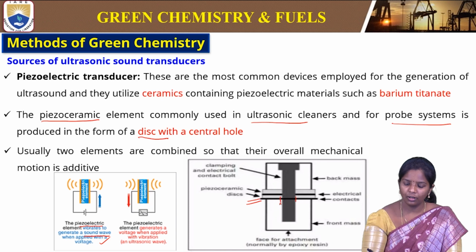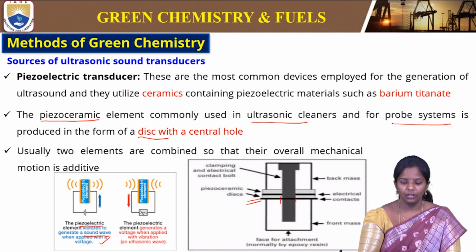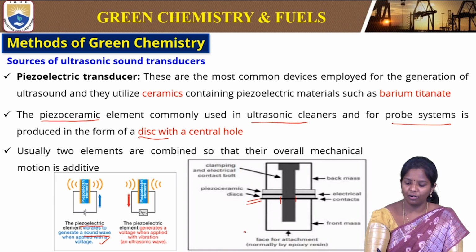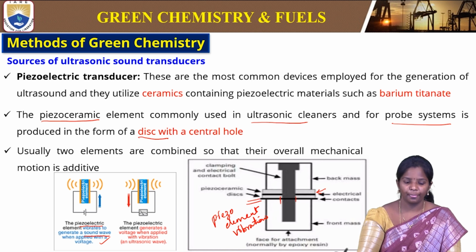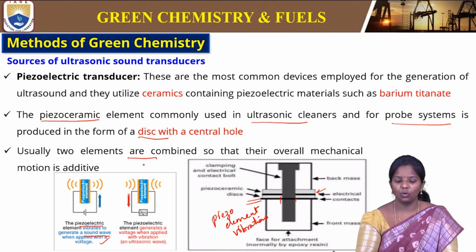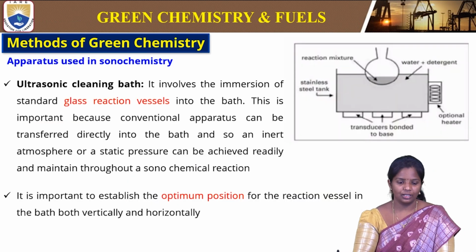Whenever there is an input of electrical energy, the piezo element will vibrate, giving rise to ultrasound waves. This is the phenomenon and the main principle on which the piezoelectric transducer works. Usually two elements are combined so that the overall mechanical motion is additive. It means it gives a good amount of energy.